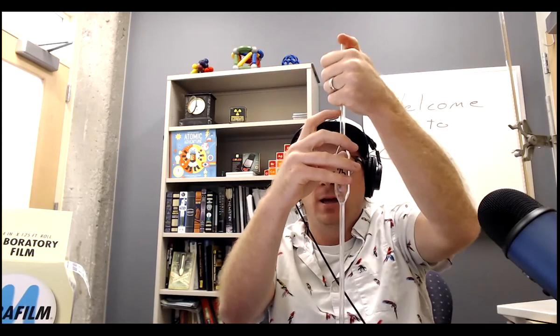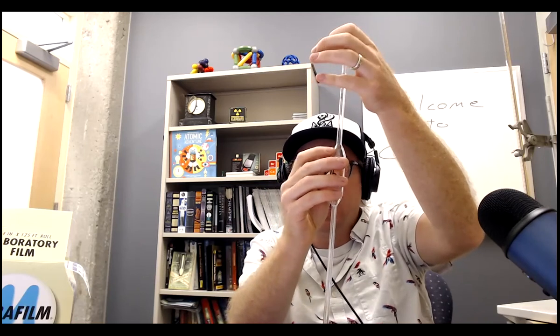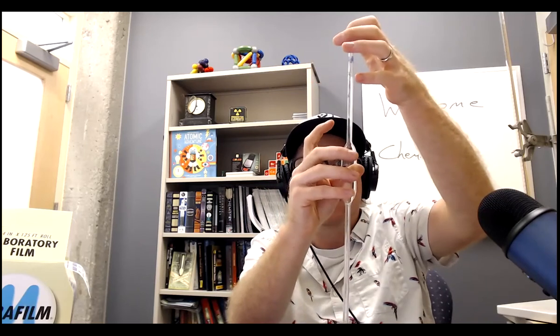Slowly. If you try to get to the line by just lifting your thumb, it'll be too much, and you've got to pull some more back in. So if you slowly twist it with your thumb on there, you'll find that twisting it just the right way will slowly dial it down. Get it right on the meniscus.